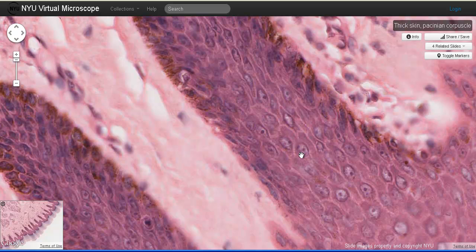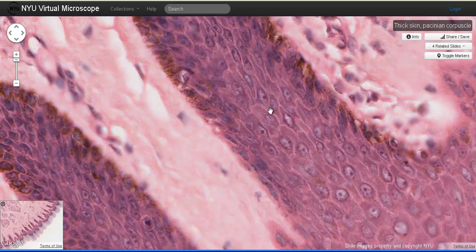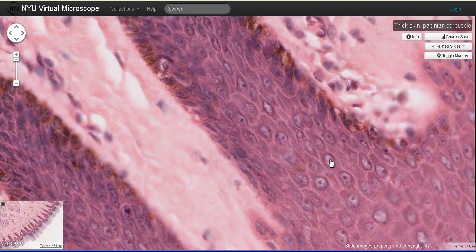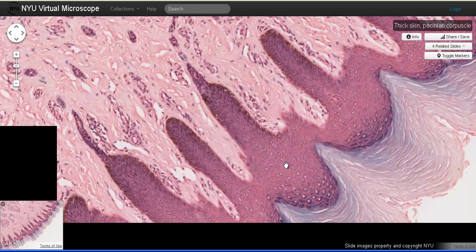The zone above the stratum basale is the stratum spinosum. Note the spiny appearance, described as looking somewhat like a little holly leaf in this particular region. This spiny appearance is due to dehydration of the cells as they were being prepared to be viewed under the light microscope. We can see regions where the cells remain attached to each other by anchoring junctions. The stratum spinosum is the thickest layer of living cells.